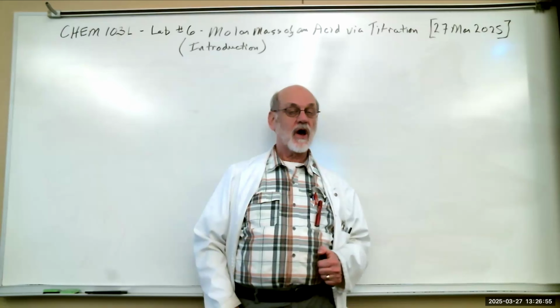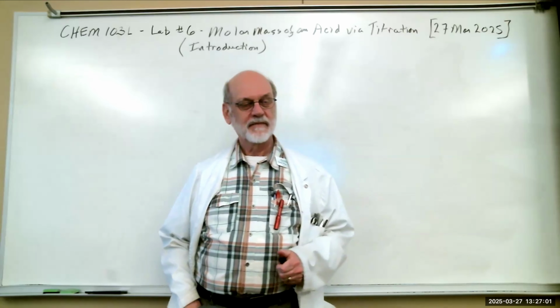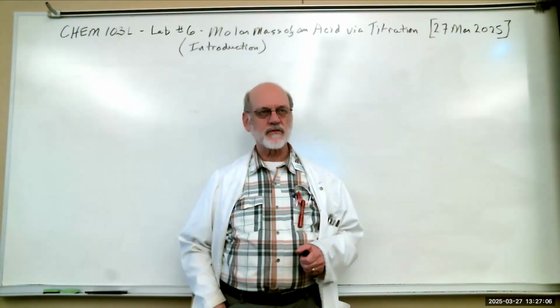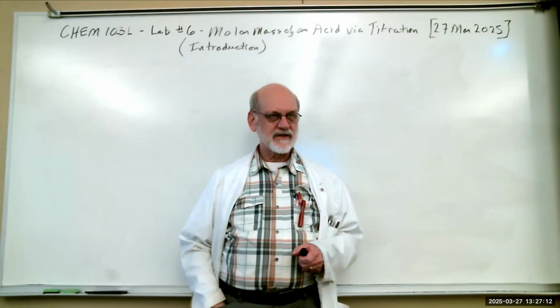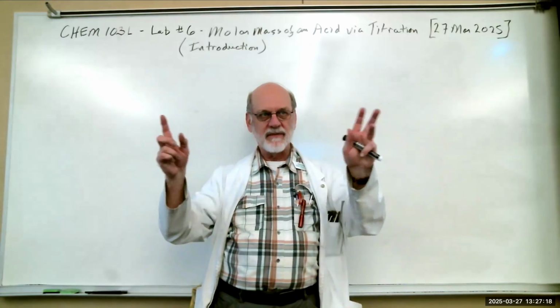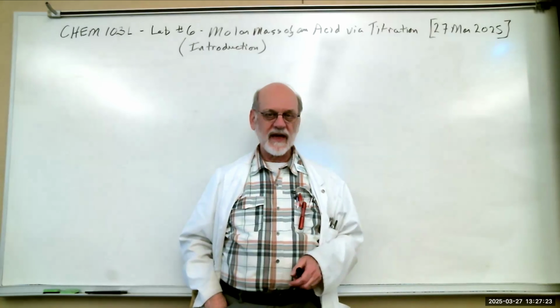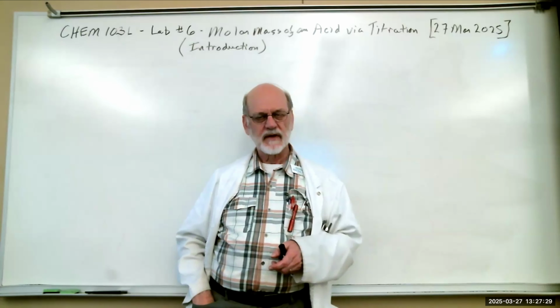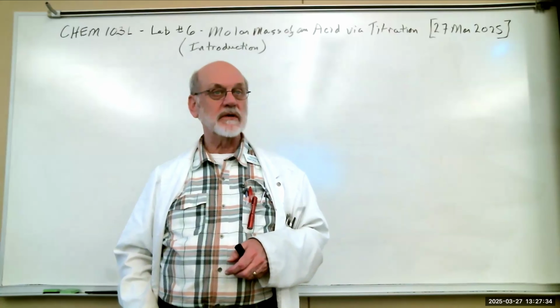How about what else? Glassware. You can always run into Murphy's Law, right? A dropped beaker will send pieces to the furthest reaches of the universe. And that's my interpretation. You drop a beaker, it's going to shatter. You'll find glass pieces from that beaker in every part of the lab for the next 6 months. So be careful with that. We're not going to use any hot things, right? So that's not a problem. Just skin protection, clothes protection, eye protection. That should do it.